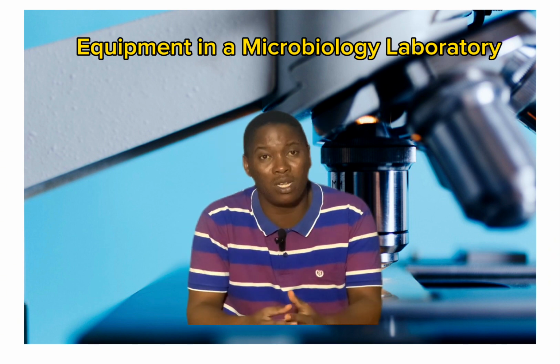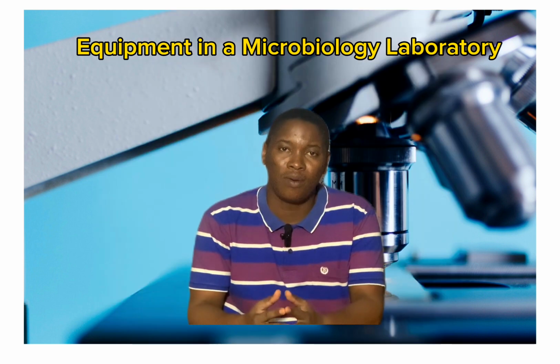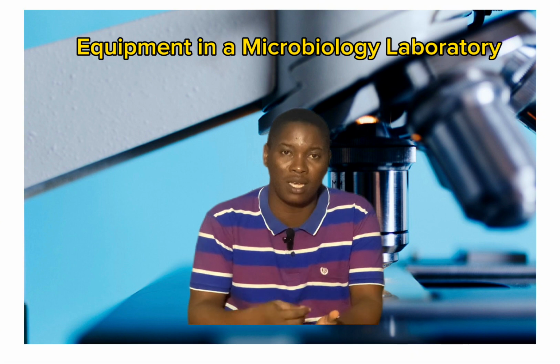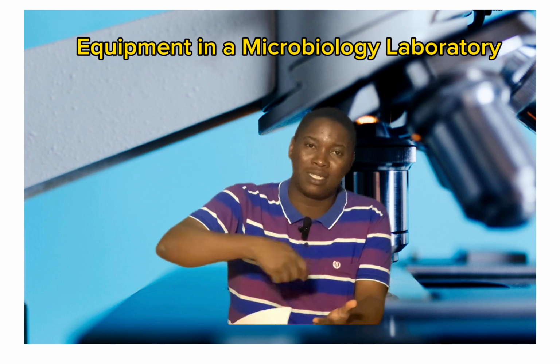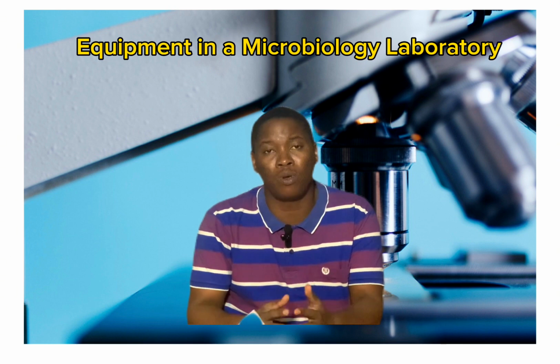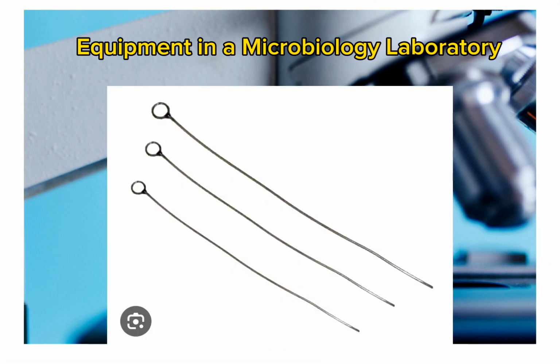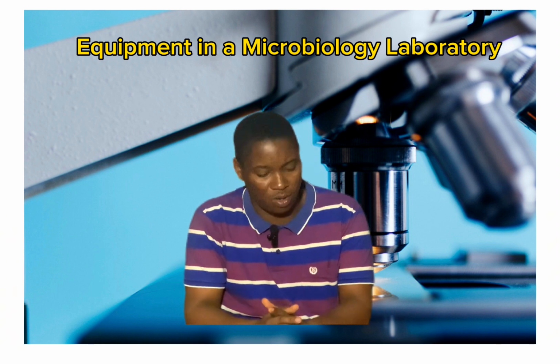Lastly, we have what we call the inoculating loop. Some people call it the inoculating wire loop. This loop is a small, thin metal structure that is used for streaking. That is when the scientist wants to take microorganisms or take samples and streak them onto agar. Streaking means taking the microorganism from the sample and spreading it on the culture plate, on the petri dish. So this is what we refer to as streaking, and the inoculating loop or the wire loop is used to perform this streaking.